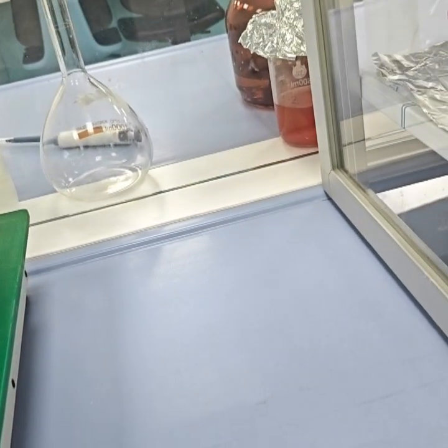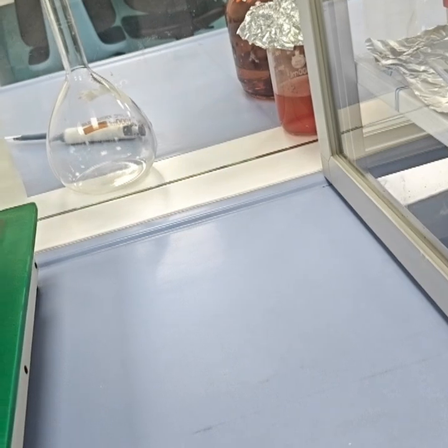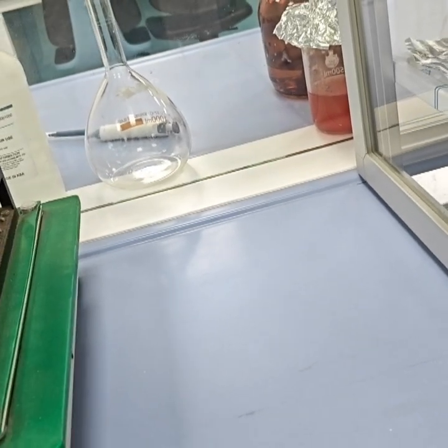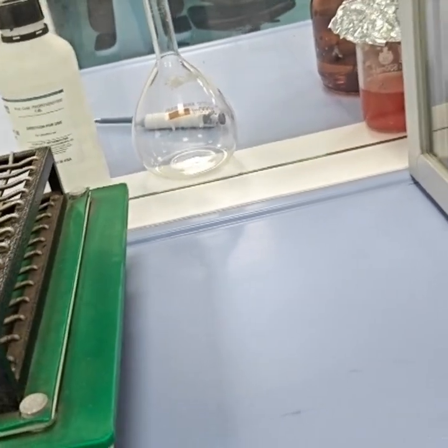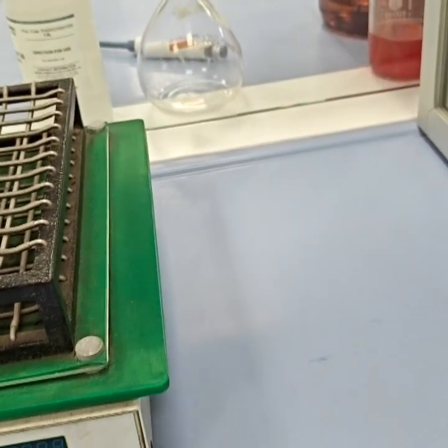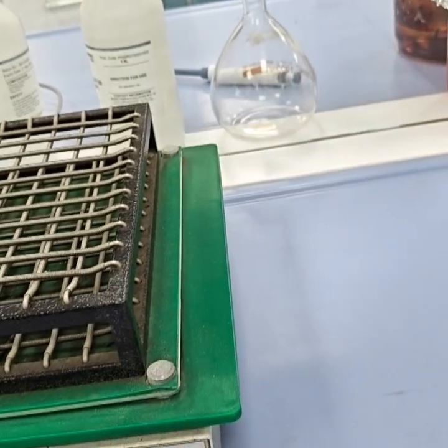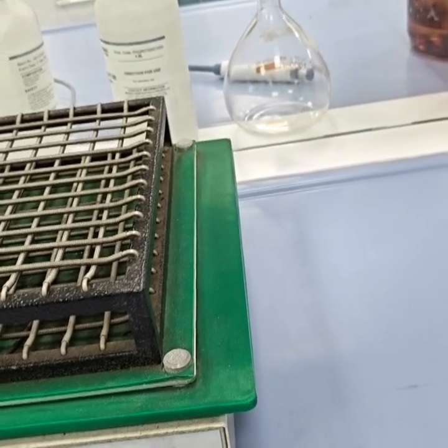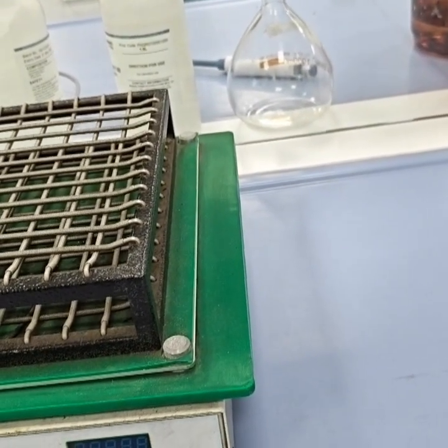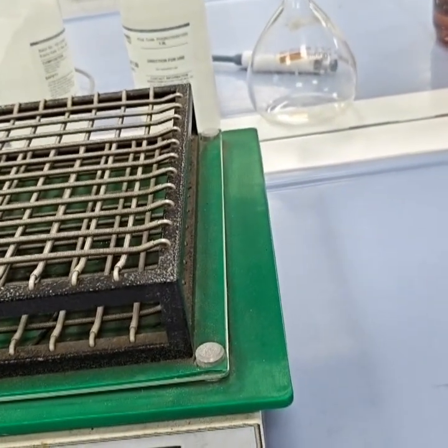Also maintain a logbook. You must maintain a logbook. There you could put your sample ID, preservative, analysis details. Now these are all as per the APHA 2017 standard methods, and also US EPA methods 200.7, 200.8, 3050B, 410.4, and also as per WHO 2017 guidelines for drinking water quality.